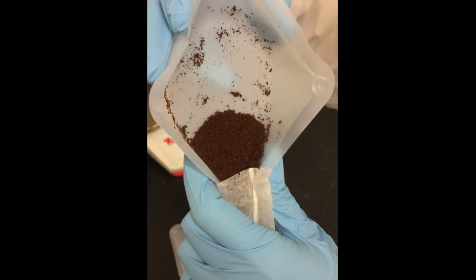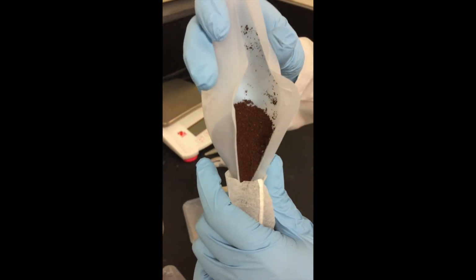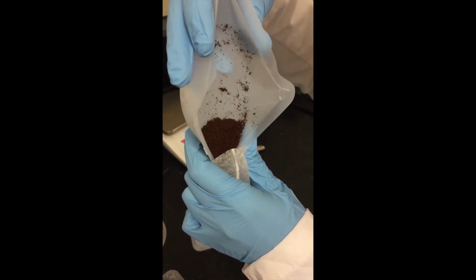Possible error may have existed within this experiment. In regards to varying the grind size, the method by which this was accomplished was through the use of a coffee grinder. The coffee grinder may have not produced reliable grind sizes, and this may have affected the absorbance collected for those trials where we altered grind size.